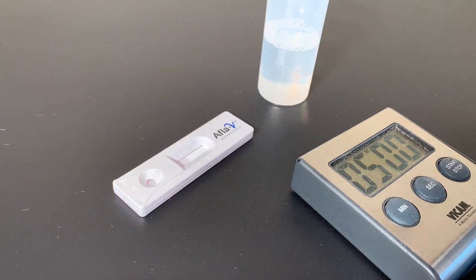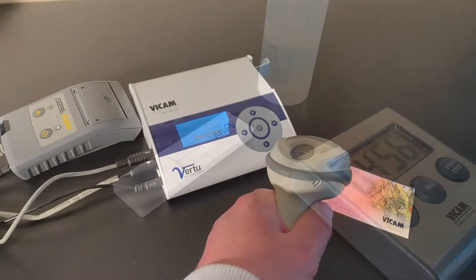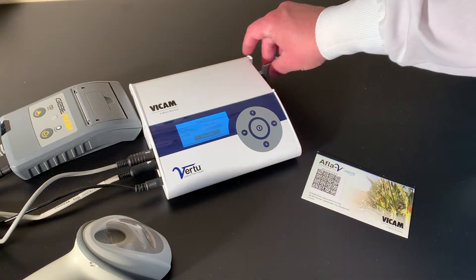Place the strip on a flat surface for 5 minutes. While waiting, scan the Virtu calibration barcode for the AFLA-V Virtu test.